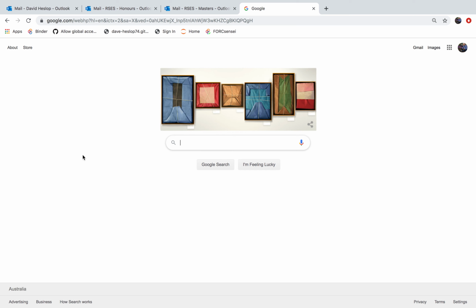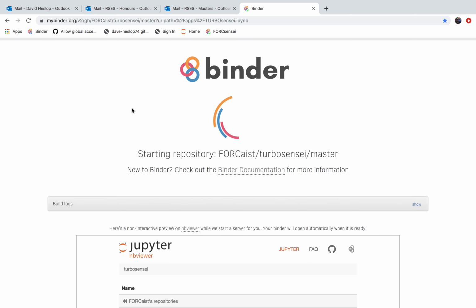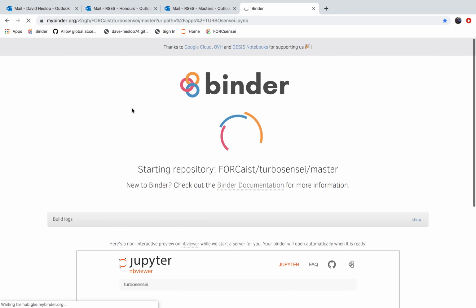So if you click on the link that I sent you in the email, that'll open up an instance of the software running on Binder. Everything's in a Jupyter notebook, but I've tried to make it as kind of un-notebook-esque as possible, just with buttons to click and so on. So it can take a few minutes to render a new notebook, but here, it took 10 seconds or so, and the notebook will appear.